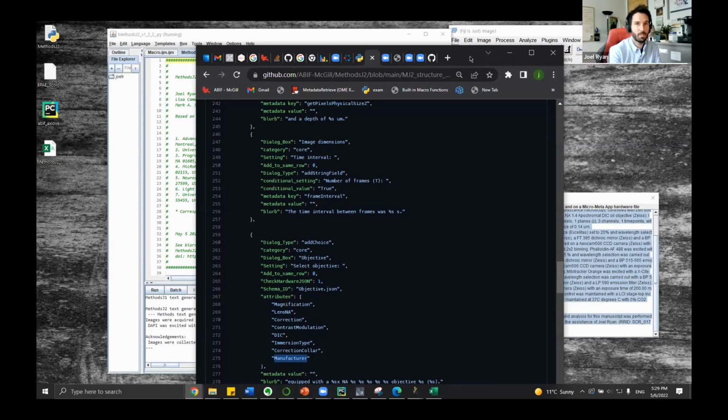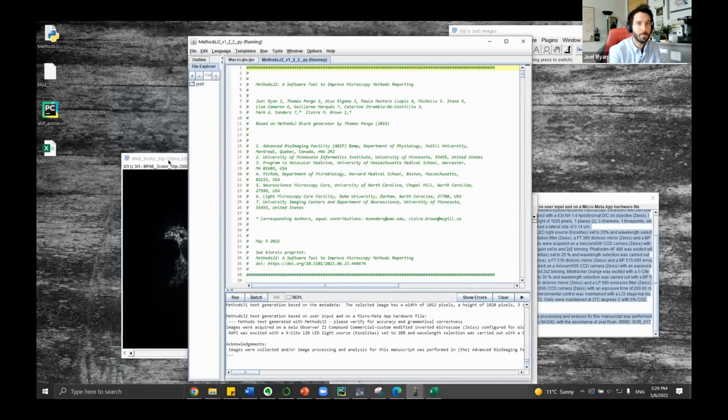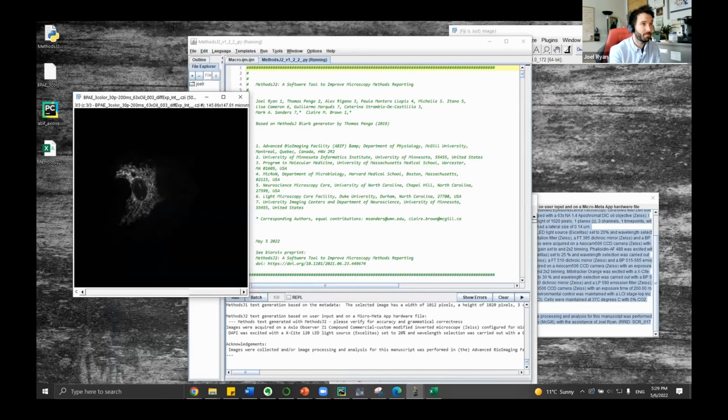Right, so I'll stop there. And did I miss a few questions? If there are any questions, people want to unmute and chat, that's also fine. So maybe if there's any questions specifically about MethodsJ2, we could start with that.